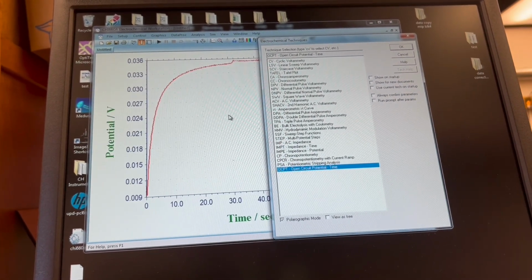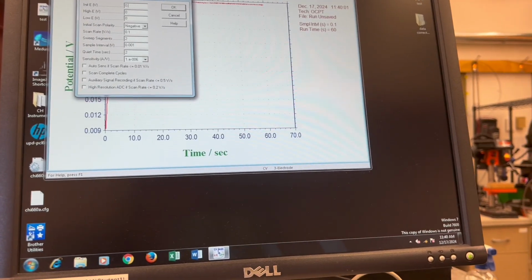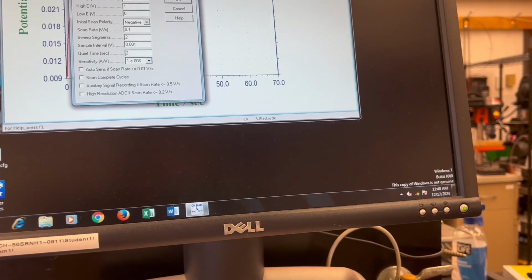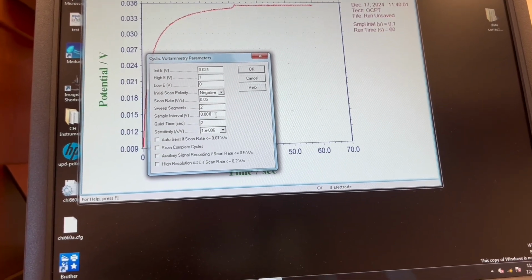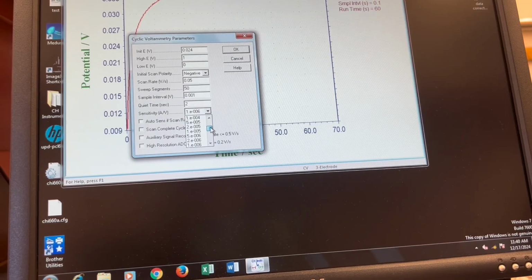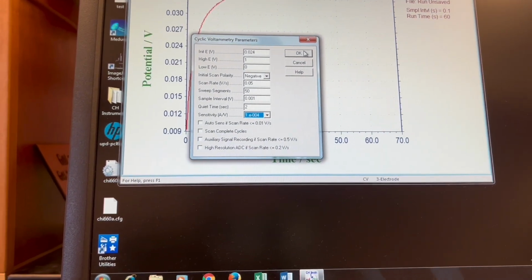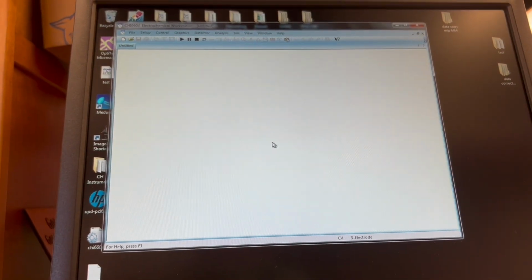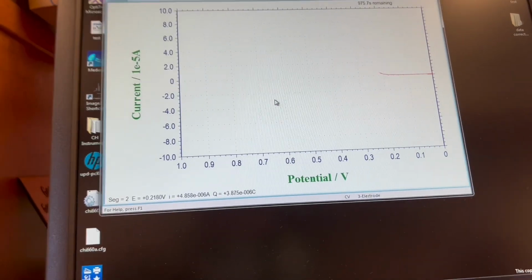And then we click the big T again to choose CV, click OK, and we enter the potential corresponding to the center of the graph here as the initial voltage, and the height as 1, and the other parameters are written in the SOP. And then click OK. Click the same black triangle to let it run. And then it will take about 15 minutes.